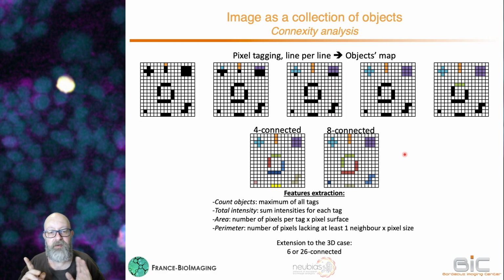If you consider all the diagonals, you've got 9 pixels on the top, 9 pixels on the bottom, and the 8 pixels on the same plane, which makes 26.